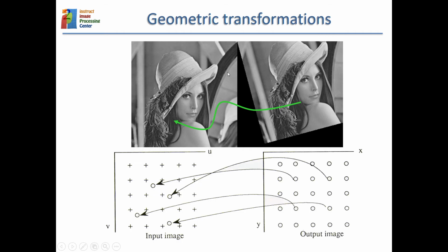So then you take every pixel in the output image, and you try to copy from the input image, but because of the sampling, it turns out that you don't have those values anymore. So they were present in the analog image, but not in the digital image.